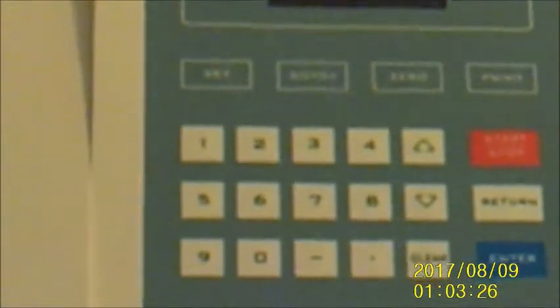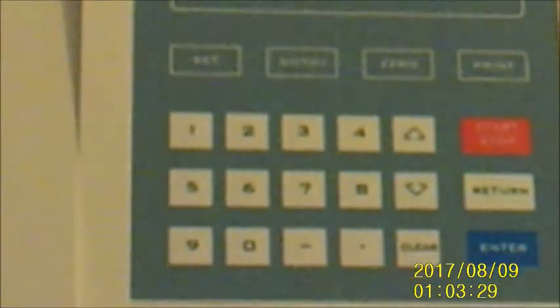It requires a 20-minute warm-up before operation. I am still learning how it works, and so it might be several days before I am ready to start testing samples. It allows you to input the desired wavelength via the white keypad shown here.